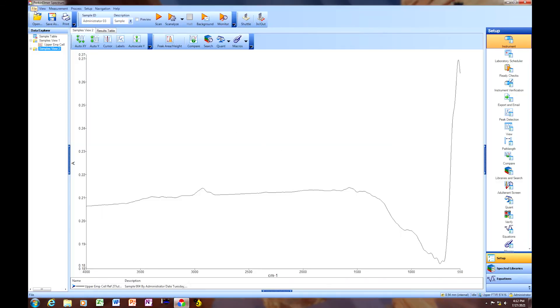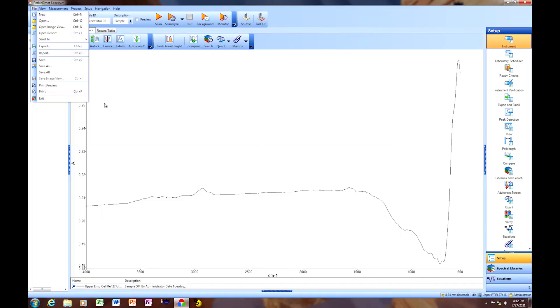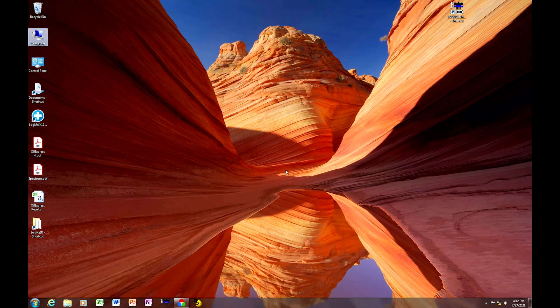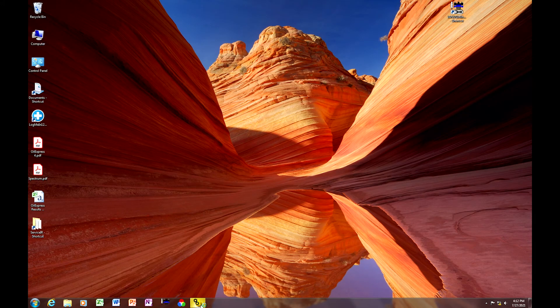So once you've completed that, you're going to close out spectrum. And you're going to go to the oil express software.